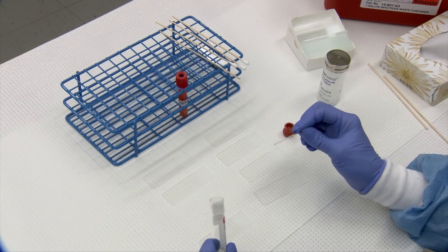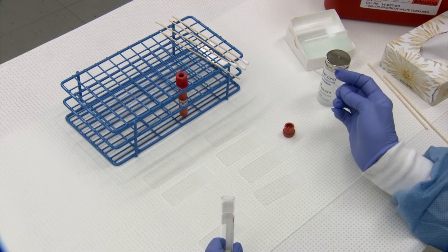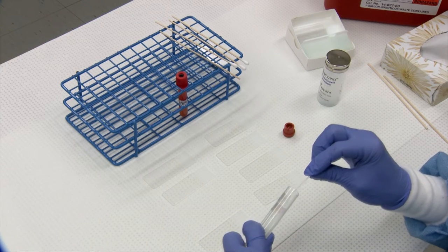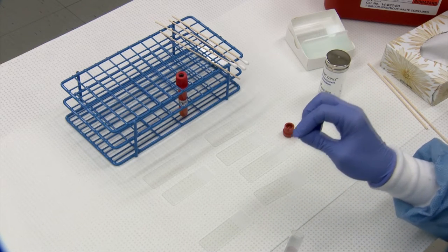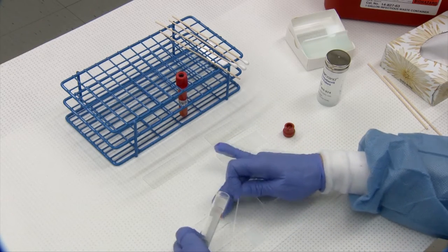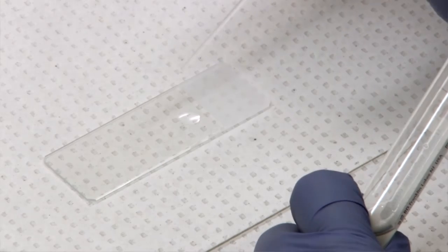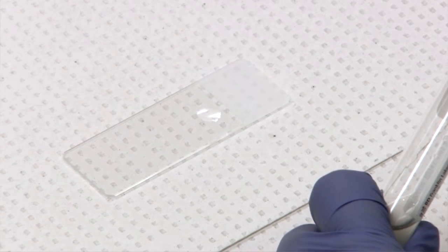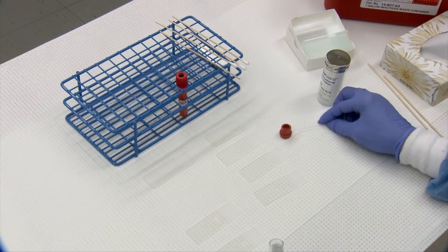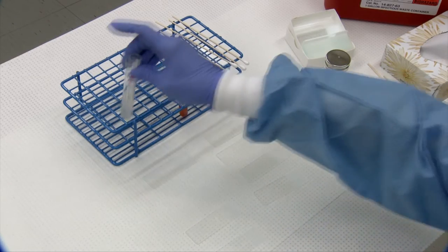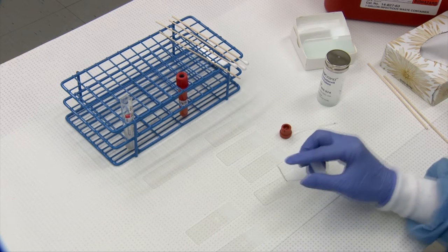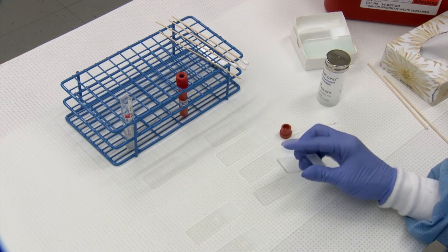Your direct and your line smears can be done using a PCV tube, packed cell volume tube. Fill your tube about three quarters full and you'll make a medium-sized drop again above your frosted edge. And these are very runny samples so it's a bit tougher to make a good smear than it does a blood smear. You don't need to worry about quality really. More of the goal is to get cells on the slide.